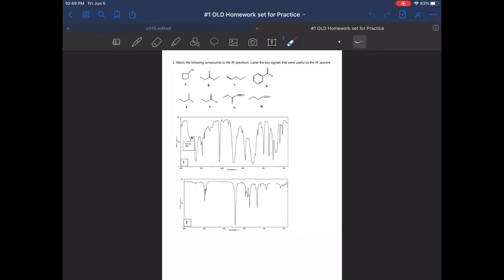Hi guys, I want to make a few practice videos working some problems. So this one I'm going to focus on IR. I've chosen the multiple choice from the old homework assignment because there's a lot of different things we can talk about here. There will also just be a PDF answer key of this up if you want to look at that. But I'm going to walk through how I matched these and what you're looking for.